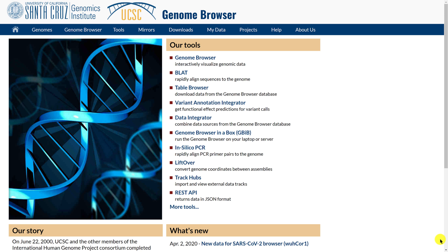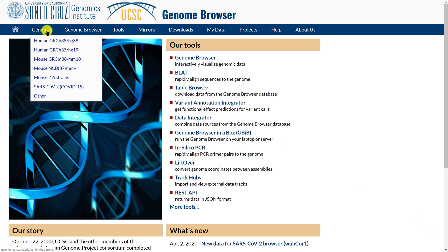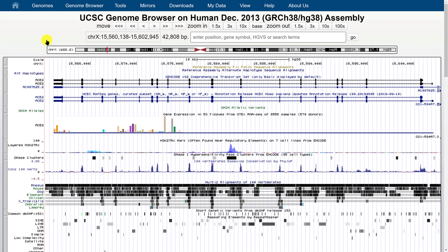Here I am on the main UCSC genome browser page and I'm just going to pick any genome and start with the latest human genome. What I'm going to show you today is true for all genomes on the genome browser — these are generic pieces of information about how to change the settings of the genome browser.